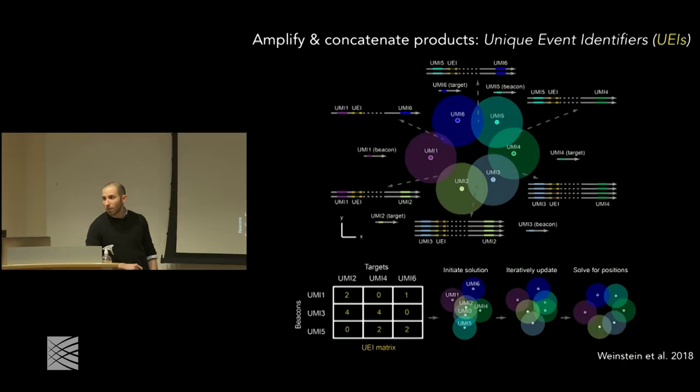That's right. Obviously, it's important for molecules to colocalize to the extent that there will actually be reactions happening. If you had just a UMI out in the middle of space, you wouldn't see it. I guess I understand the function that beacons and targets are playing in the analysis, or in the chemistry. Oh, yeah, sure. At the level of the chemistry, I guess it's perfectly fair. I didn't include anything on that in these slides.